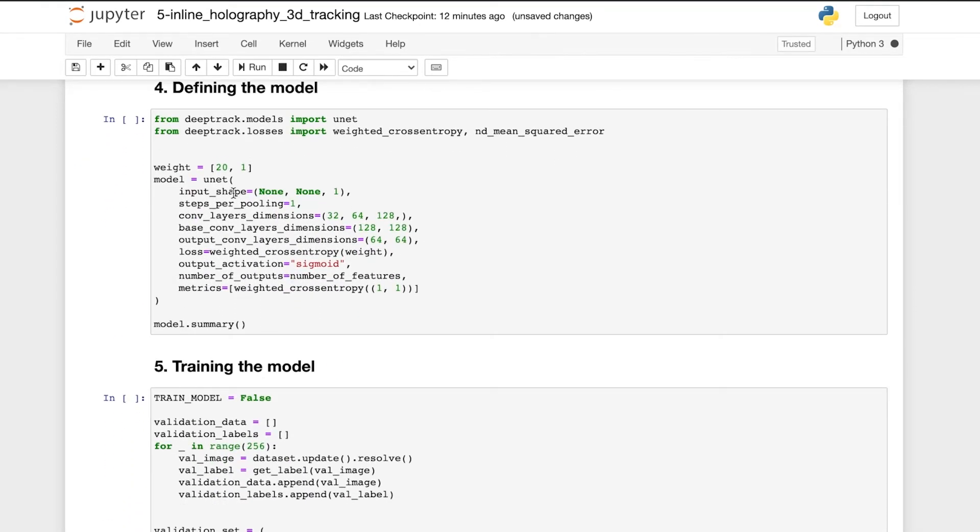Now that we have our training dataset ready, we move on to the network. Here we use a U-net architecture.